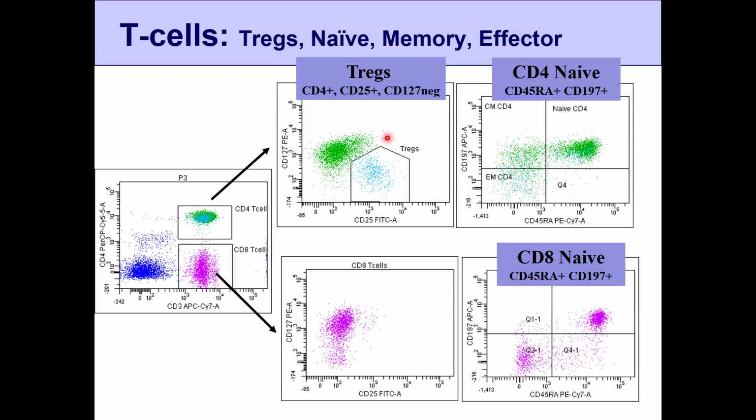This is your Tregs. It is also very important in most of the autoimmune, in your cancer immunology. Then your CD8 memory and Treg memory, in memory, your central memory, effector memory, TEMRA. So this is all very important. So flow cytometry has the power to give you the knowledge about all these things.